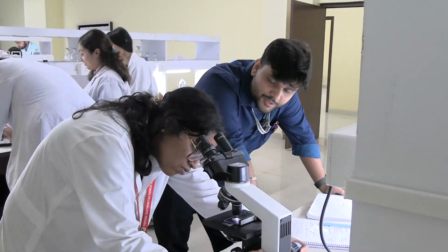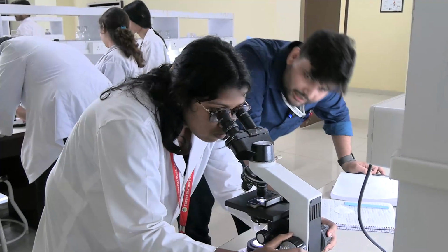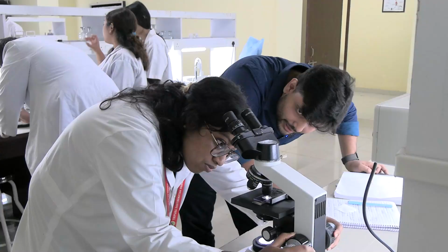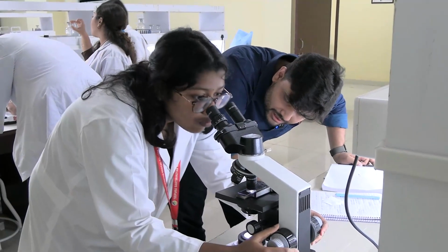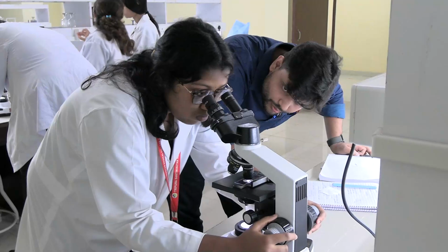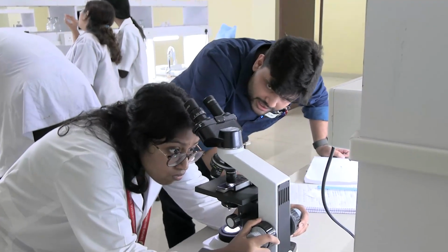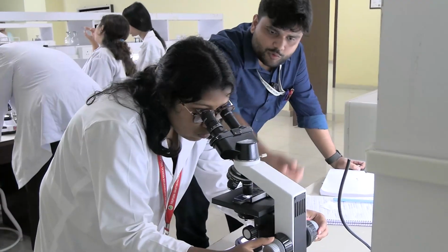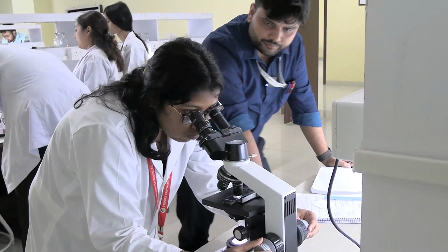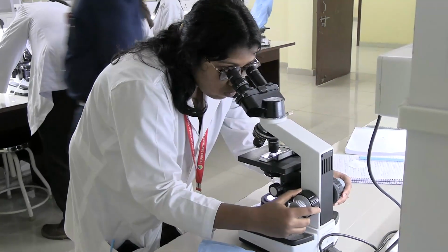The oil immersion lens is meant to be dipped in the oil. So you need to actually manually take it up at the highest point. At the point you find some resistance, take it up a little bit more. Look here and take it up. While you are moving the mechanical stage up, always look here and feel for the resistance. Okay, I think that's enough. Now I will only move it in the opposite direction. Okay, try to focus it.